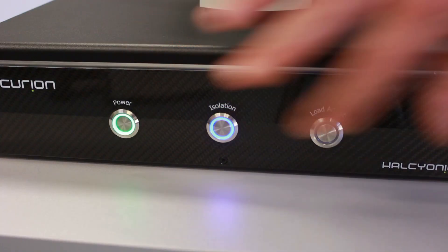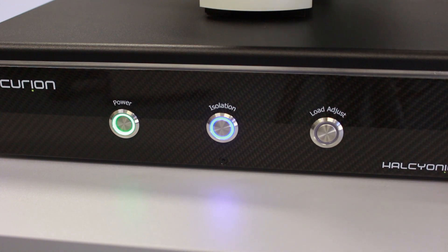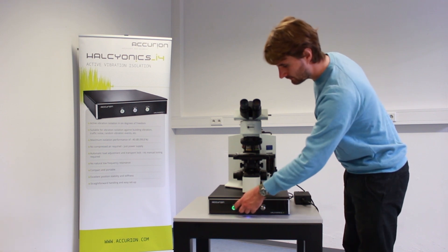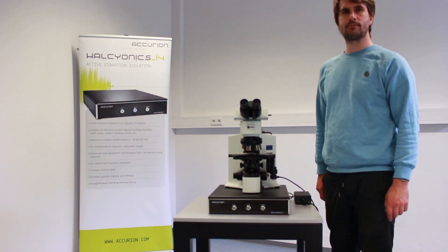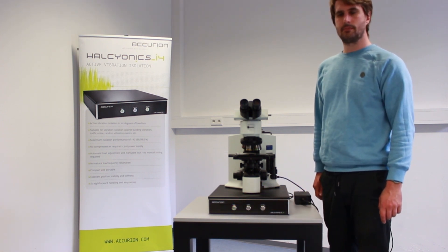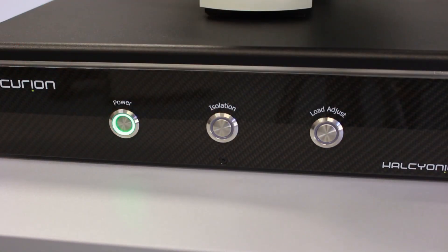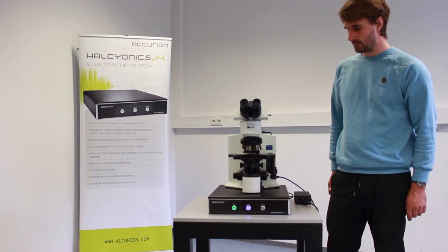Push the isolation button to start the active isolation. It's up to you whether you constantly run the isolation system or only turn it on for actual use. If the load doesn't change, there is no need for readjusting the system after turning it back on. When doing so, the system starts isolating once the initialization is finished and the blue LED remains steady.